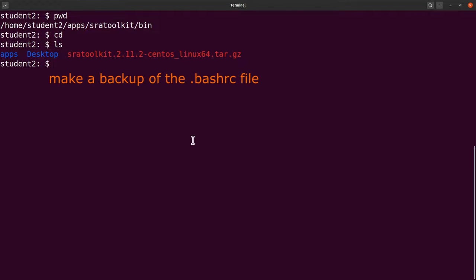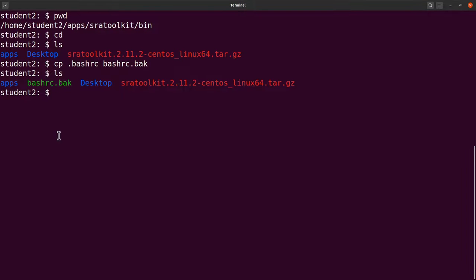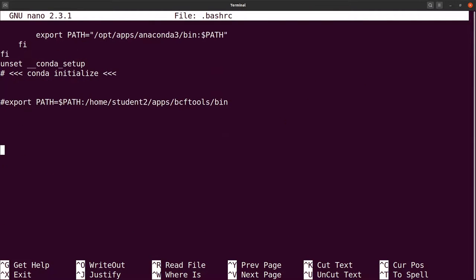Before editing, it's better to make a backup of the .bashrc file so that if something goes wrong we can revert to the original. Let's do: cp .bashrc .bashrc.bak. It's a hidden file — that's why it has a dot at the beginning. Do an ls and you'll see the backup. Now we can edit the original: nano .bashrc.